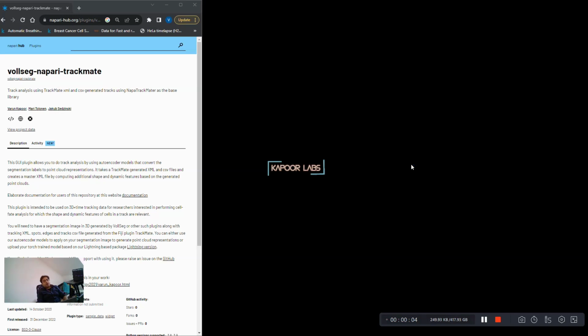In this video, I'm going to demonstrate the Vollseg Napari extension plugin called Vollseg Napari Trackmate. Now, Vollseg Napari Trackmate is a plugin which is used to visualize and do some track analysis from the tracks that come out of the Fiji plugin Trackmate.